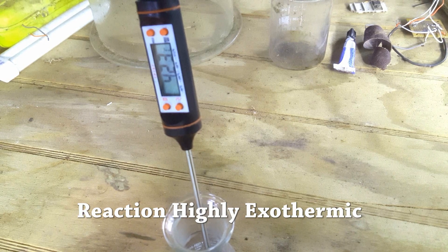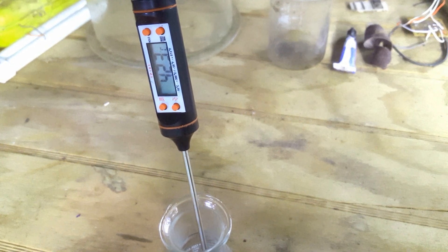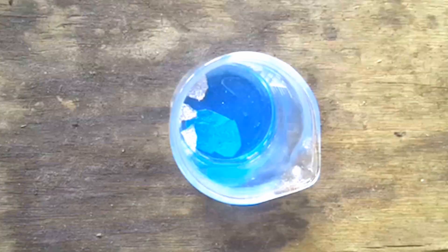We added in some fresh aluminum. Finally there's a reaction. The aluminum foil slowly turns brown copper colored.